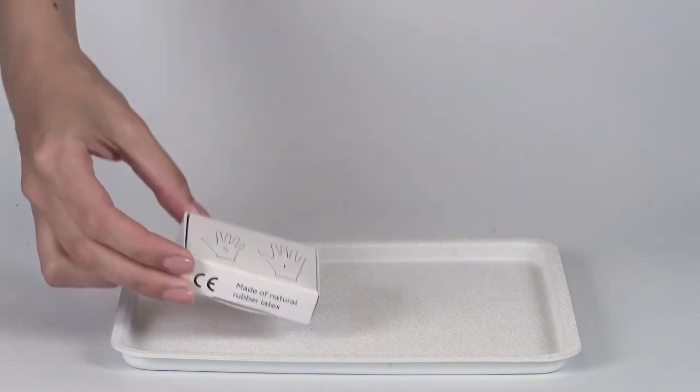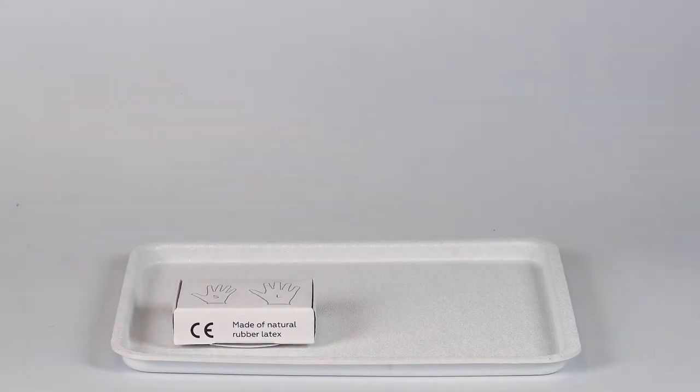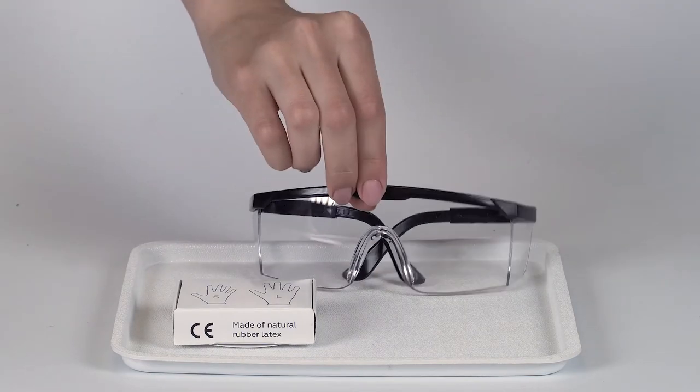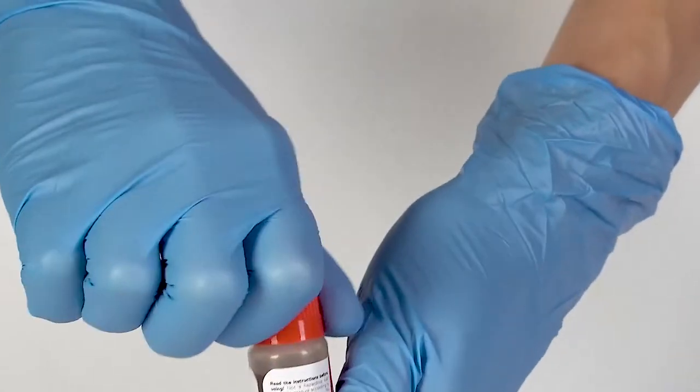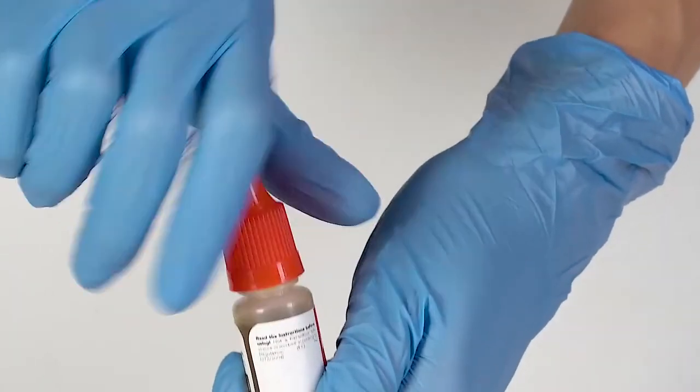Perform this experiment on a plastic tray to contain any possible spills. Don't forget to put on protective goggles before doing the experiment. To open a bottle containing a reagent, push the cap down and turn it.